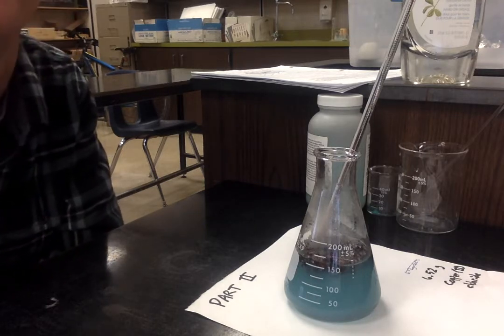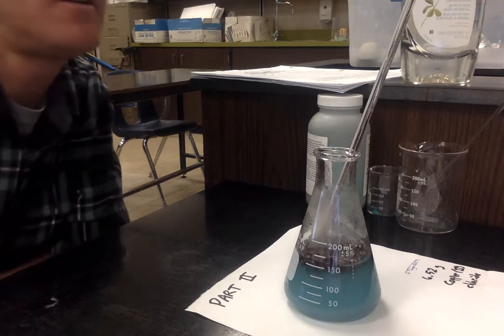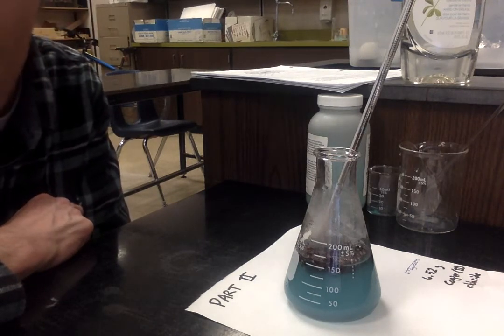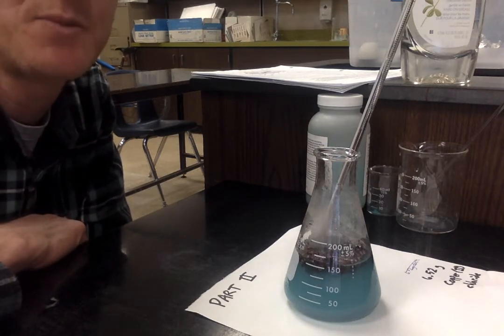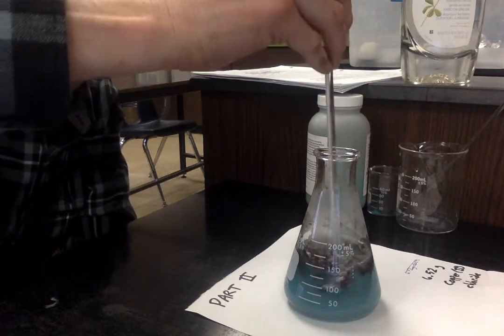So, for a review, you've got the temperature before, temperature during for each of these. You have color changes you will have seen. No gas was produced in the zinc beaker, but you saw how much gas was made in the calcium beaker. In other words, you have everything you need to answer this lab.